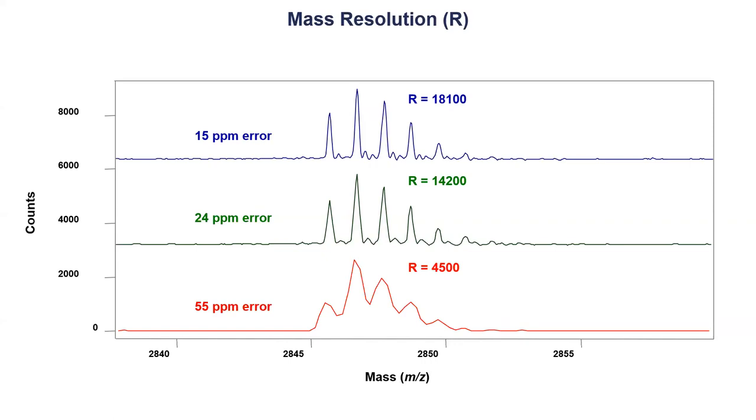And I know that there's a lot of discussion on how to handle profile data, because normally we use the acquired profile, and then we centroid it, and then no one is checking the profile mode anymore, right? So this is something I want to highlight: it's actually important to check if there's something with the mass resolution happening or if the peaks are too close.